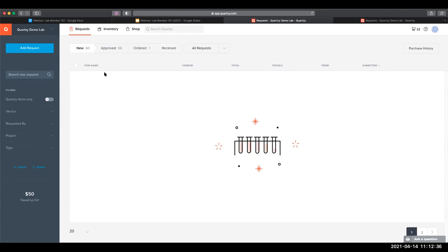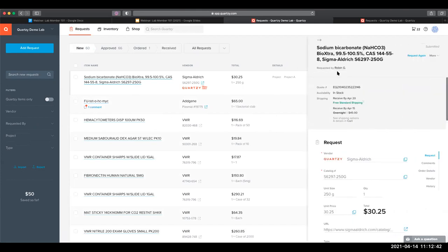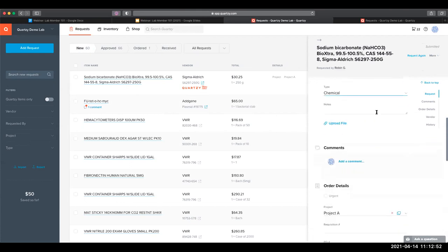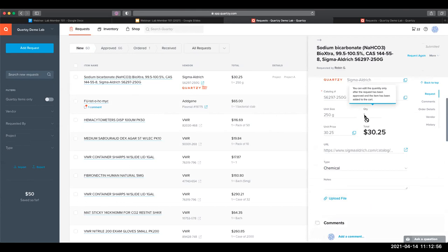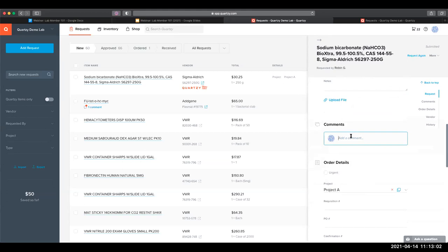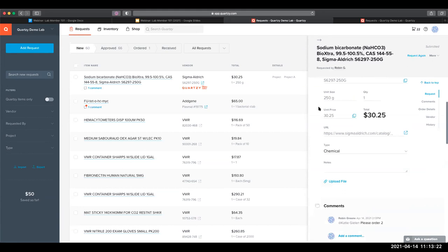But let's say we do want to buy this item from Quartsy, so I can select this first option. I want to add a couple of details here — I'll add the chemical type, since by default everything will be general supply. I'll also select the project I want this billed under. Then I'll click Request. We can go to the New tab to see that request we just added. Clicking on the item name opens up the detail panel where you'll see your quote number, availability, and all the order information that Quartsy automatically fills in. If I added a request for quantity one but I need two, I can let my lab admin know by tagging her in a comment, and she'll be notified by email so she can update the quantity.